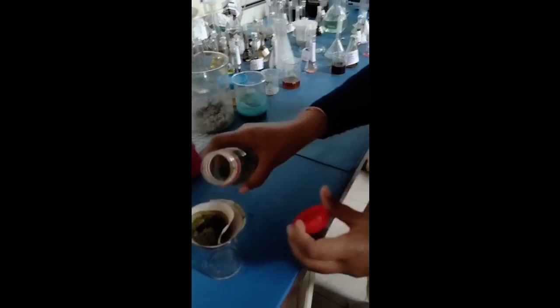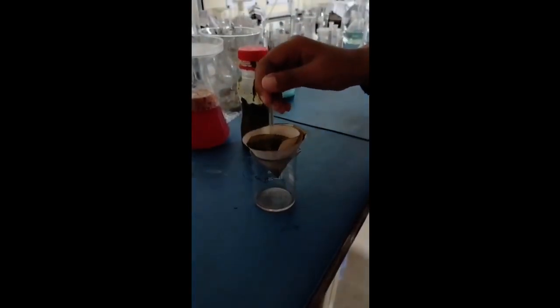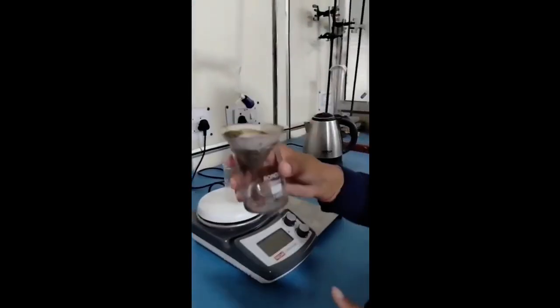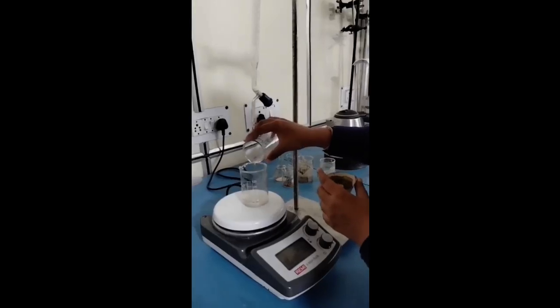Now we will take a glass beaker and a Whatman filter paper, and we will filter out 20 ml extract. It would take some time to filter out. Till then, we need to wait for 10 minutes or we can stir it. Now, we will measure 10 ml of the aliquot and take it into another beaker.